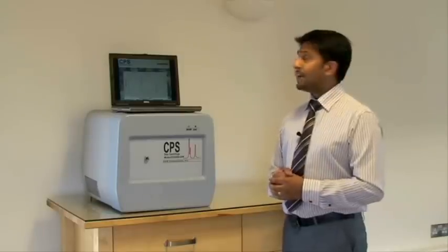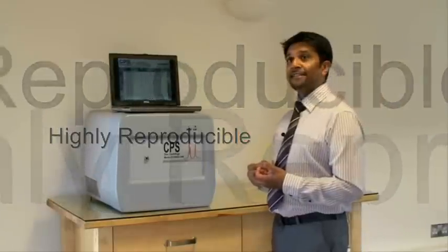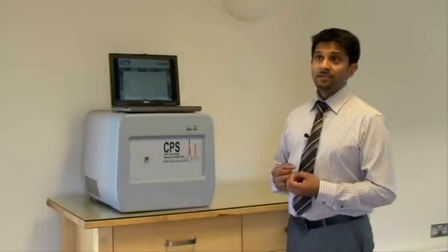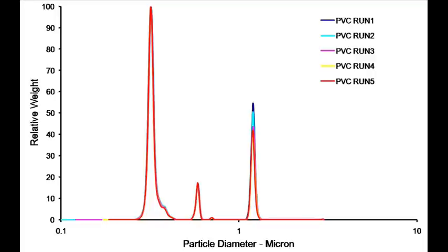The CPS technique is accurate, reliable and reproducible, and in this particular example, we've run a PVC sample five times, I believe on five different instruments, five different conditions. When we overlay the runs, we get almost identical data.